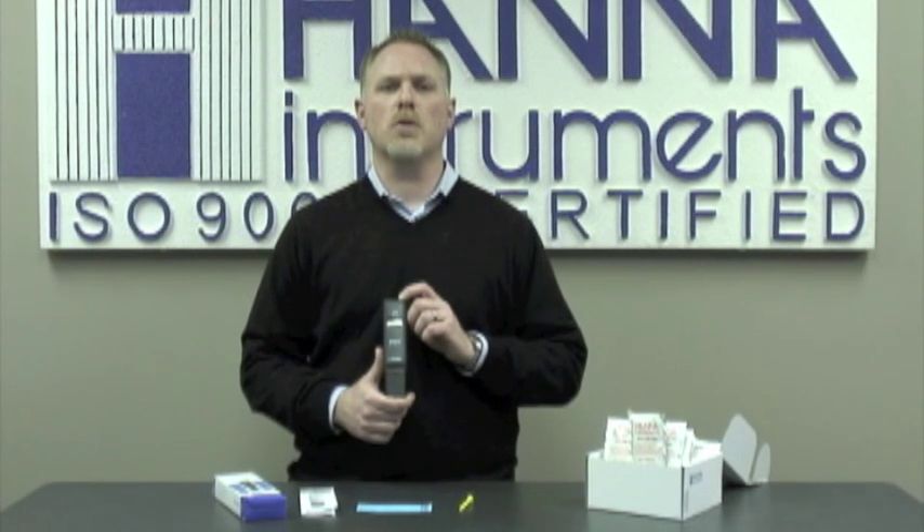Hi, my name is Ross Smith. I'm with Hanna Instruments and I'd like to introduce you to our HI-98308, our Pure Water Tester. This unit can be used to measure conductivity from 0.0 to 99.9 microsiemens.